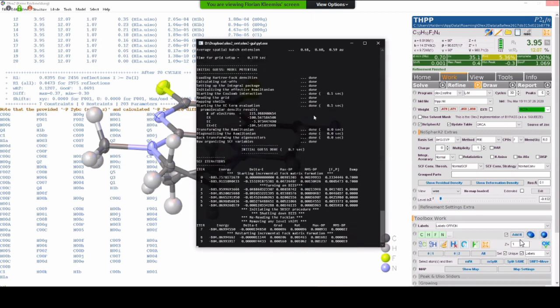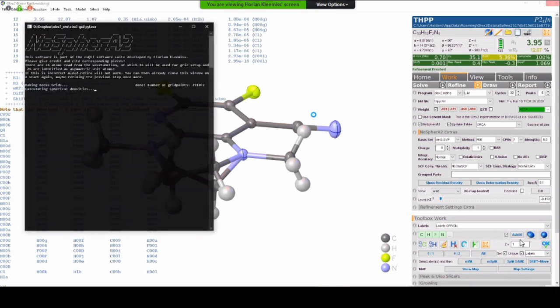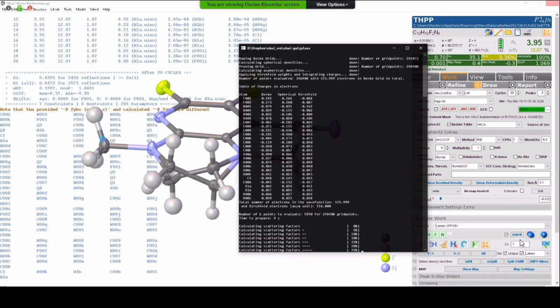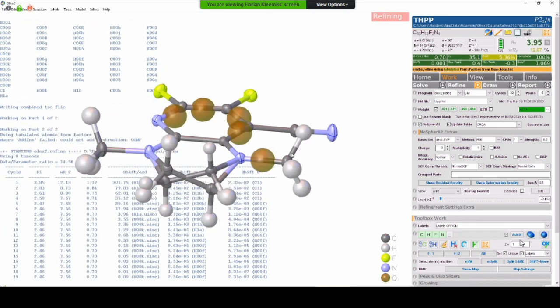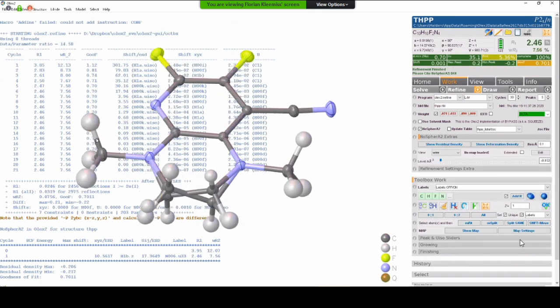And then Olex2 will merge together both information files and create the total information we need for this refinement, which hopefully will then give us nice carbon-hydrogen bond distance and featureless residual density. I haven't shown you residual density yet. I should do that. So now you can watch on screen how the hydrogen atoms get further away and how the ADPs expanded in this case a little bit. And now we have reasonable distance for a carbon-hydrogen distance.